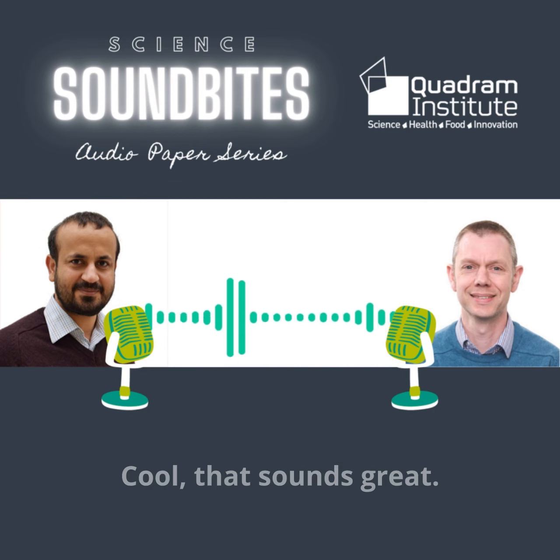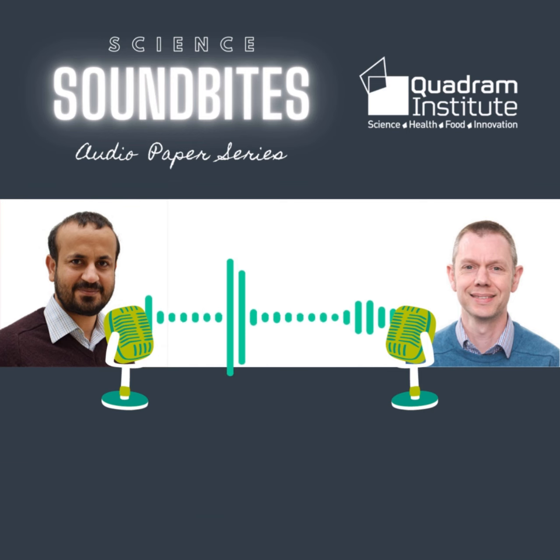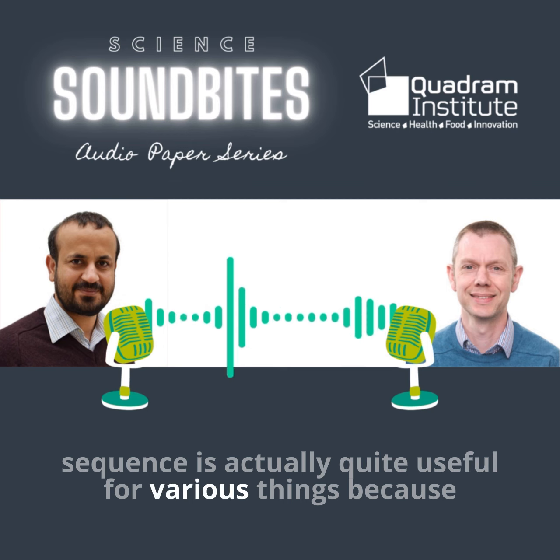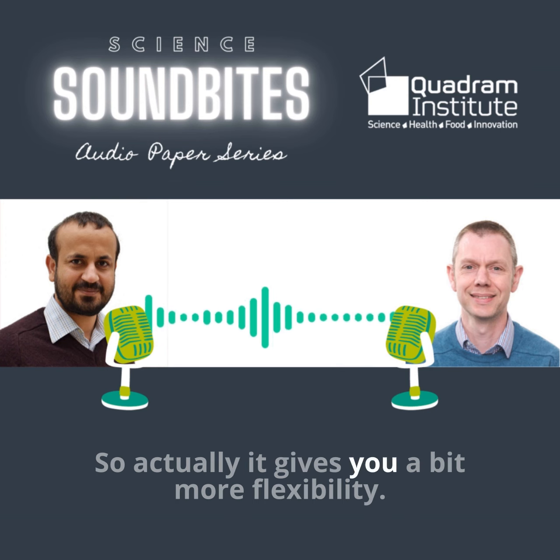Cool. That sounds great. Okay, so what are the applications of this method where we can use it? There's a couple of things. So firstly, being able to use the Oxford Nanopore sequencer is actually quite useful in various ways, because you don't need to commit an entire Illumina flow cell to running a data set. So actually, it gives you a bit more flexibility.